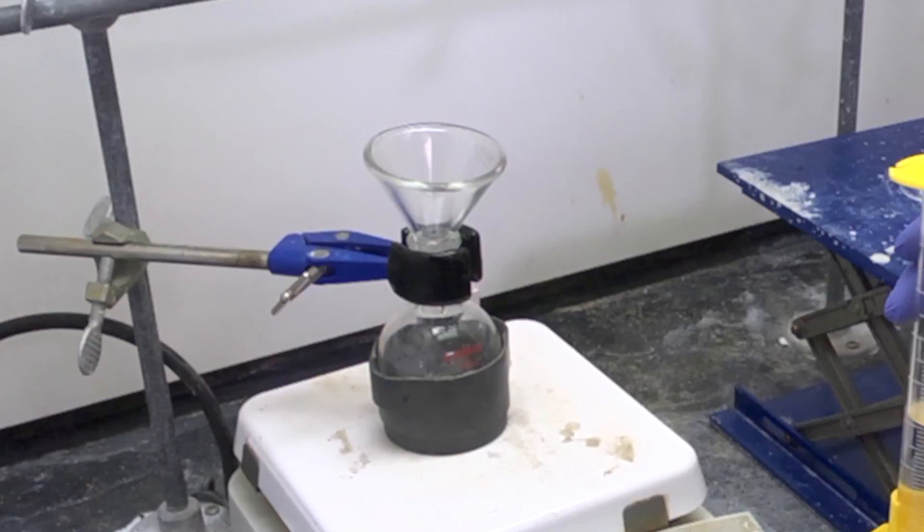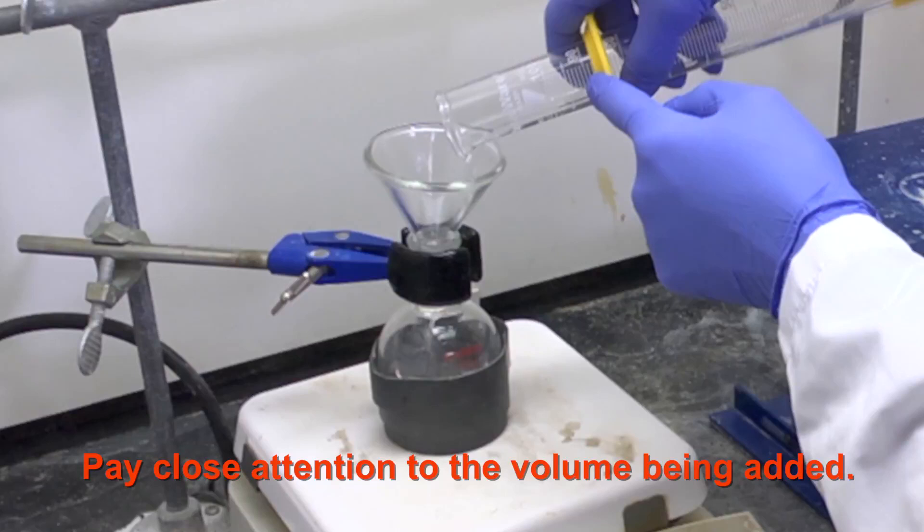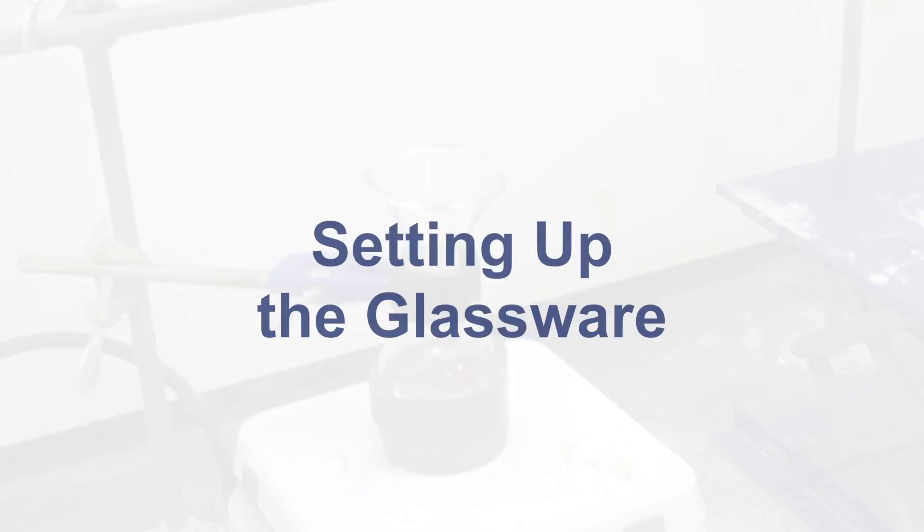When selecting a distilling flask, pay attention to the volume being added. Fill the flask more than halfway and you'll have undistilled products contaminating your condenser and fractions. Use too large of a flask and you'll lose much of your product to evaporation.